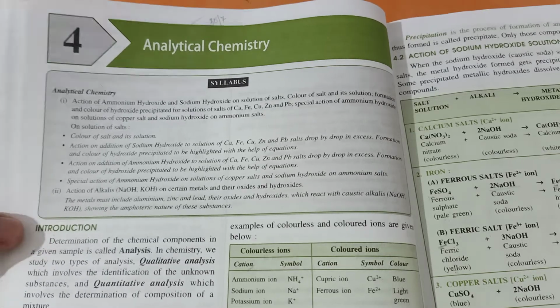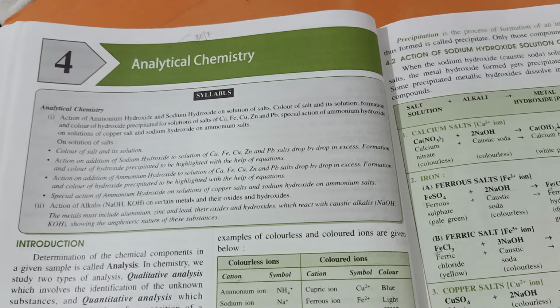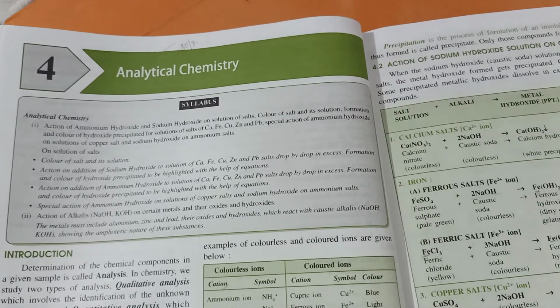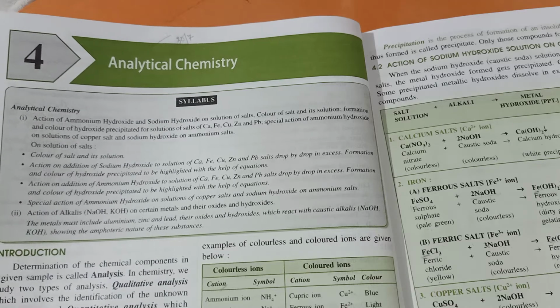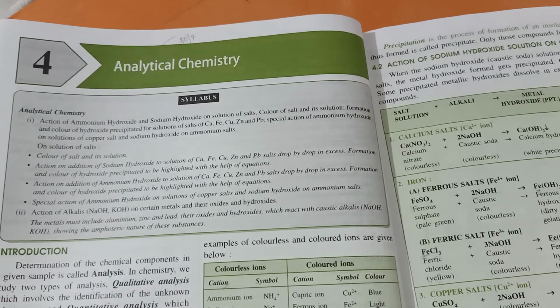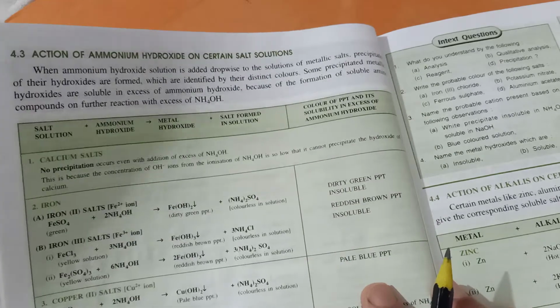Now today we are going to see the same effect and understand the similar effect of another alkali, which is a weak alkali, that is ammonium hydroxide solution, on similar metallic salt solutions. And we are going to study metallic salts of calcium, iron, copper, zinc, and lead. So we are going to see the effect of weak alkali, that is ammonium hydroxide solution, on these metallic salts.